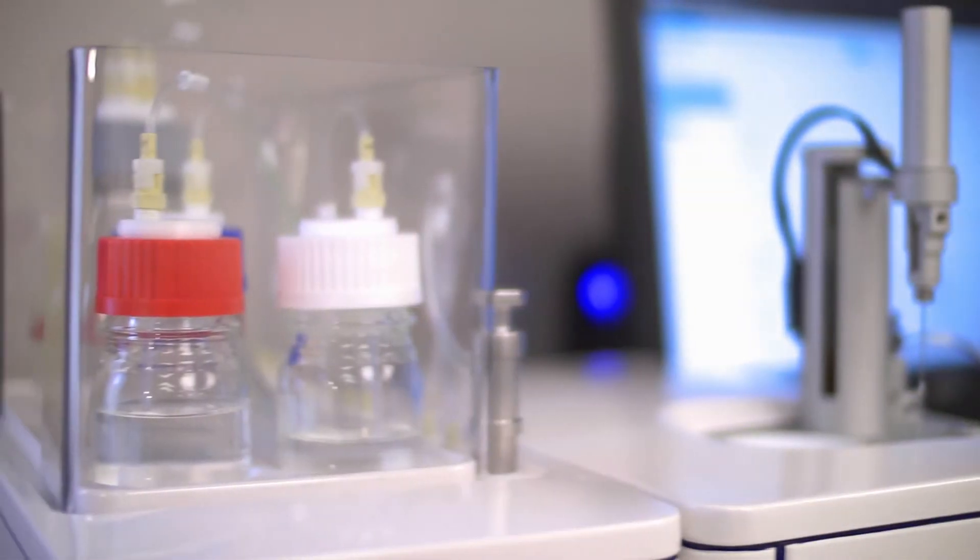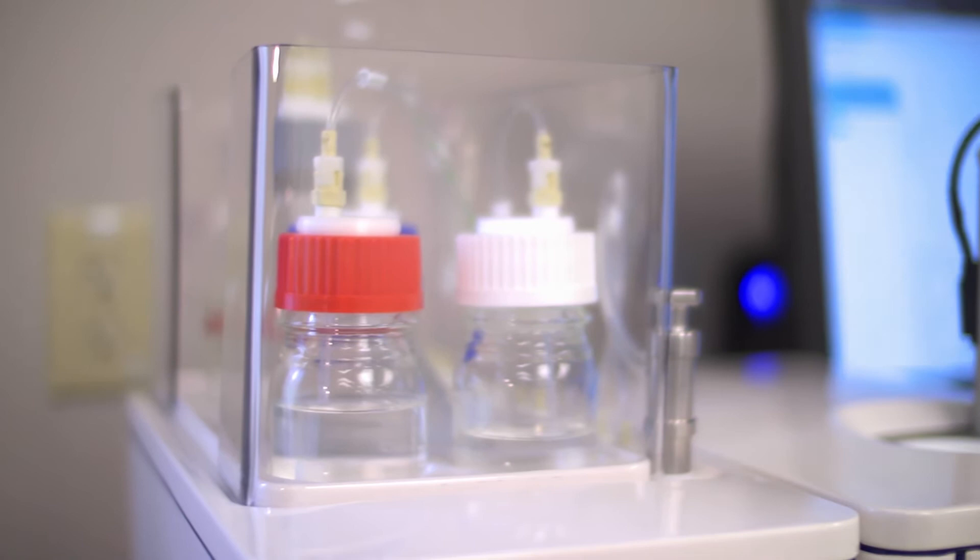The washing module is capable of cleaning both the sample cell and the titration syringe with detergent, even at elevated temperatures. With a clean sample cell and titration syringe, you can be sure to obtain high quality, reproducible results with minimal experimental artifacts.